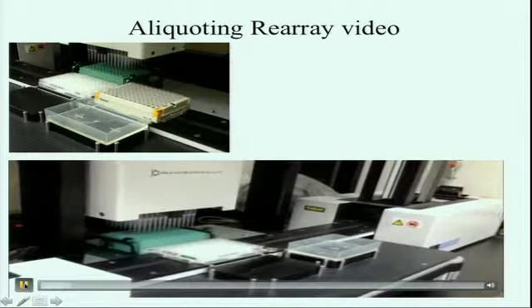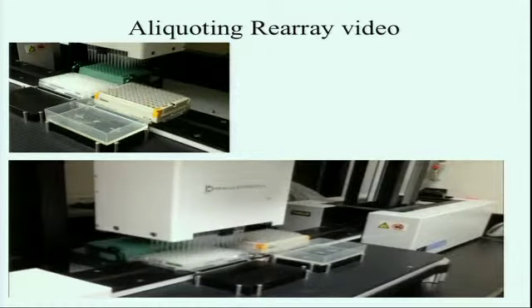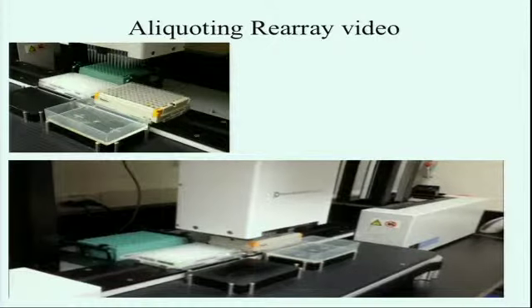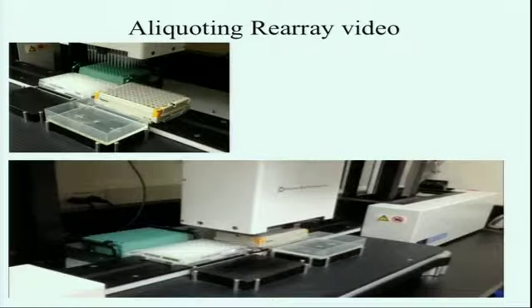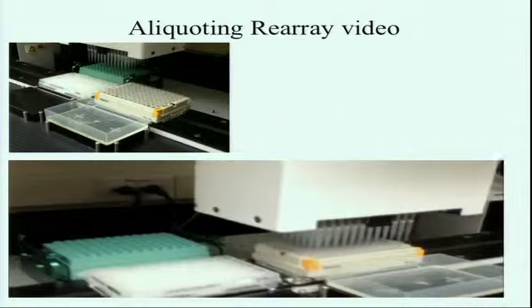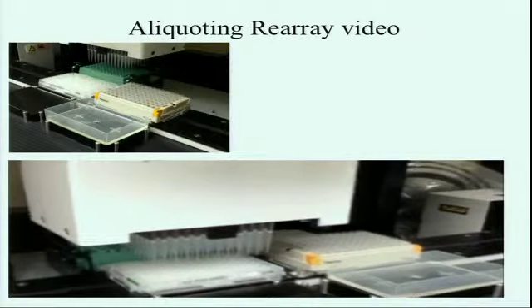Okay, there we go. Here, the destination rack's barcode is being scanned, and then the aliquot plate's barcode is being scanned, so we can track which rack is being aliquoted into which fixed plate. We use a wet dispenser that has water going in first, so that the DNA has something to dispense into. Here, it mixes a couple of steps before dispensing into the final aliquot plate.